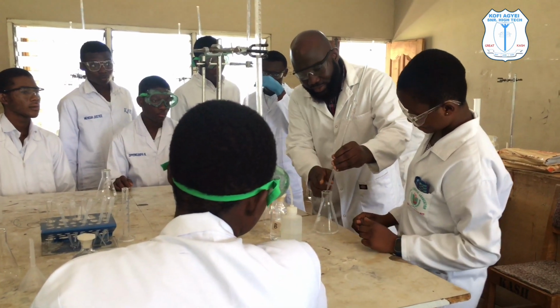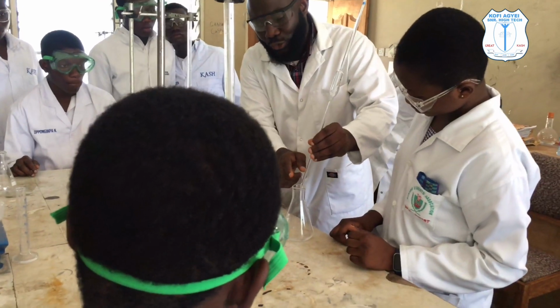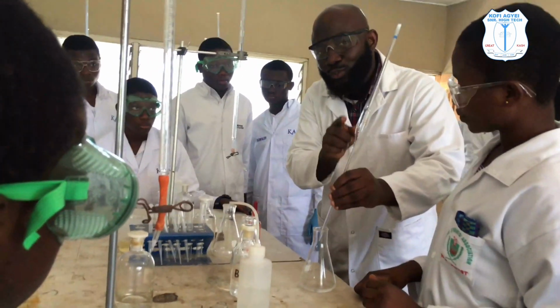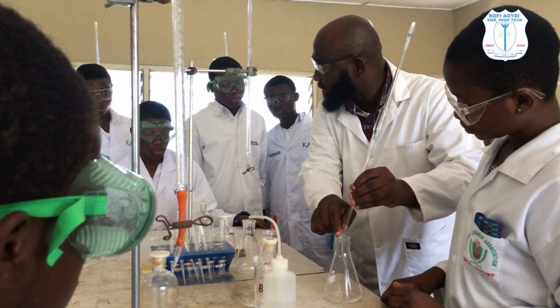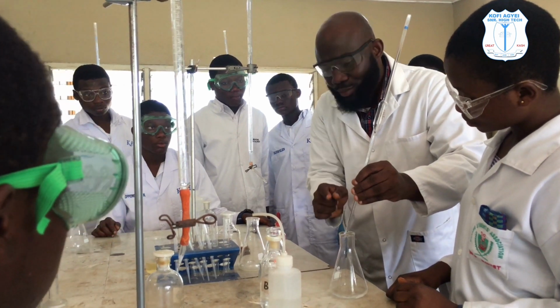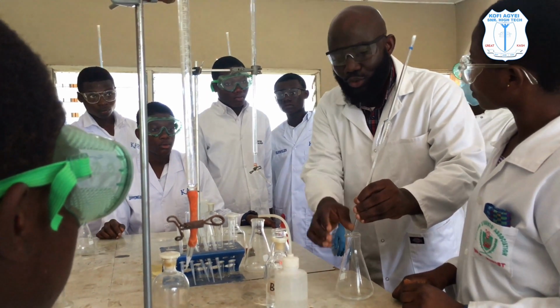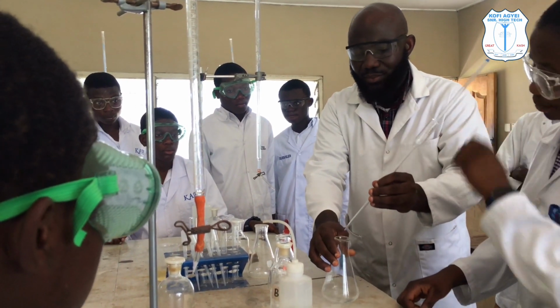Now here what is happening? A small solution left at the tip of what? The pipette. So here, ideally, we are supposed to blow a small amount of air into the pipette so that all the solution from this one will be able to enter into the conical flask. Do you get it? But when you are blowing air, make sure it doesn't follow with what? Saliva. Understood? So blow a small amount of air gently. That's it.